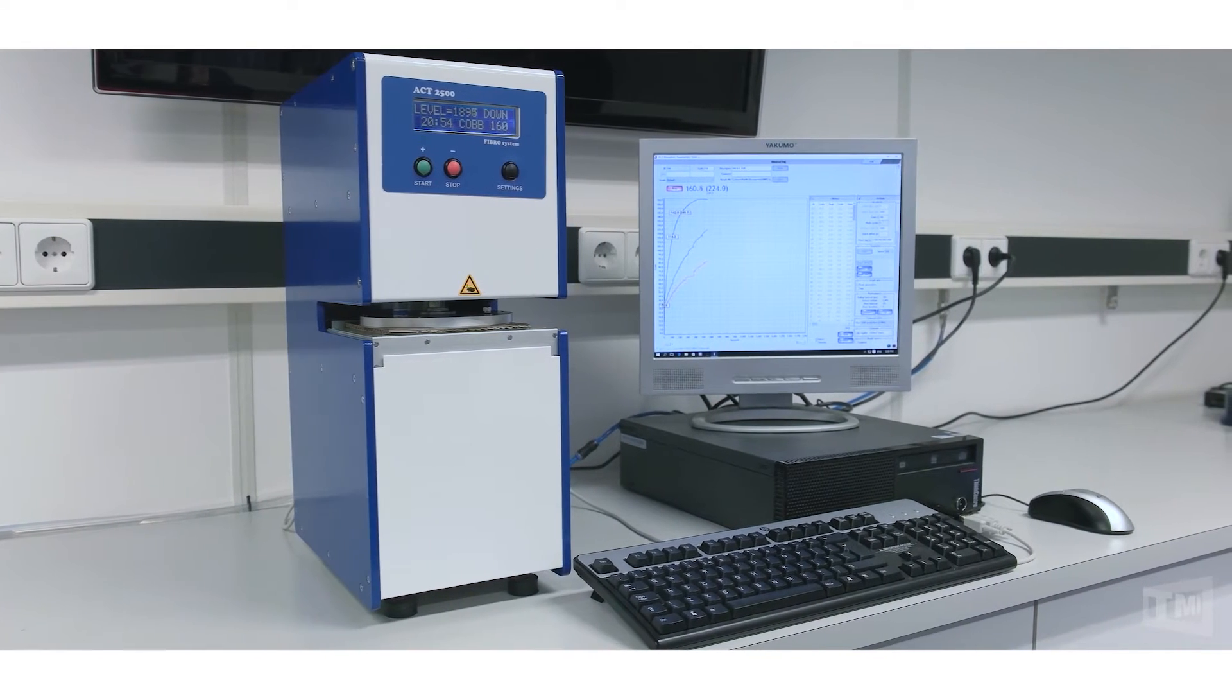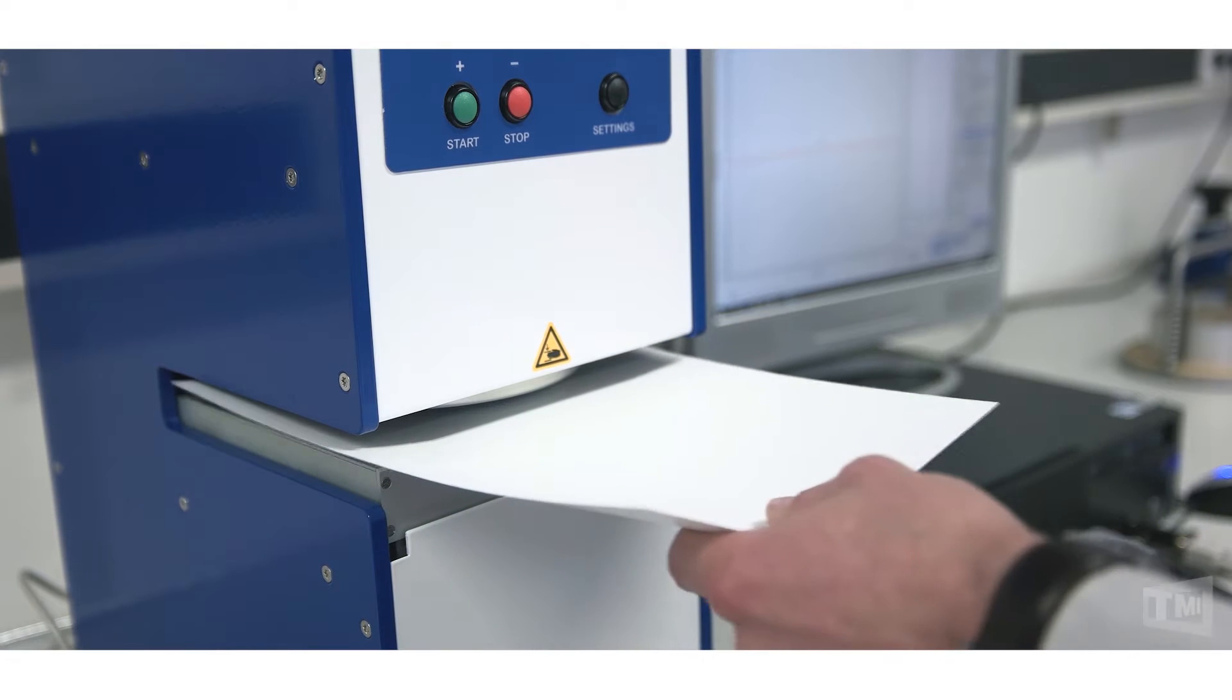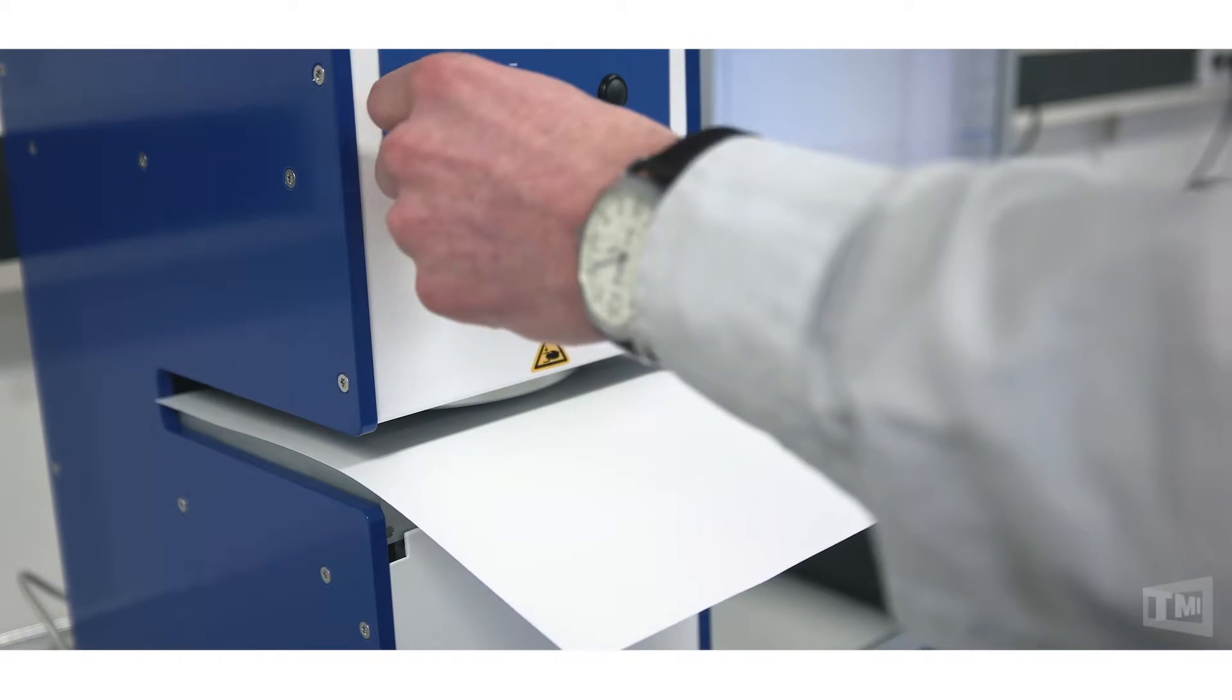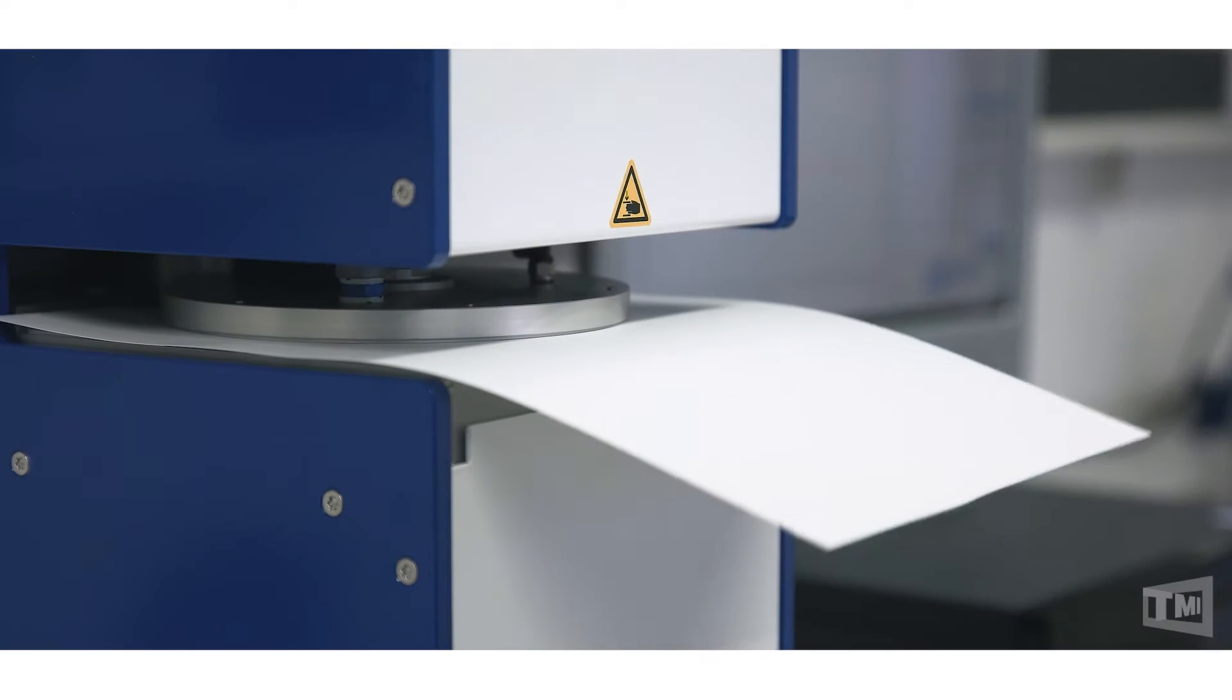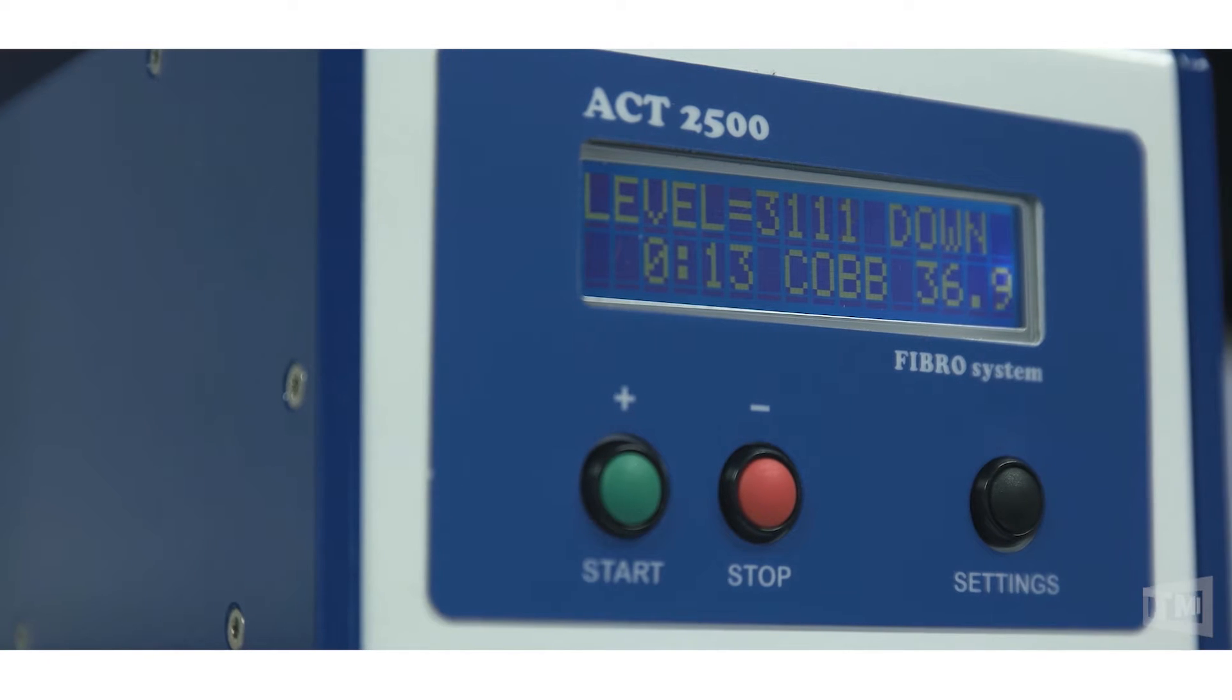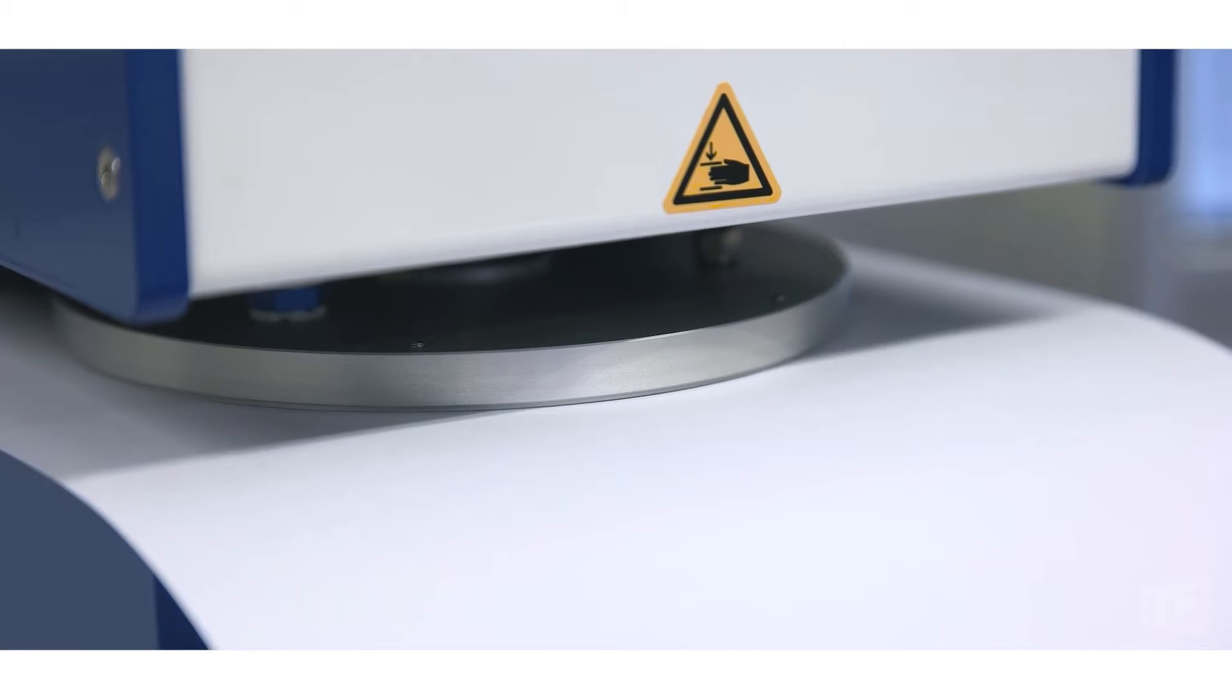The Absorption Characteristic Tester or ACT uses a sized or coated specimen placed on a porous glass disc, 100 square centimeter, from which the specimen draws water and the uptake of water is continuously monitored to produce a dynamic absorption curve automatically.